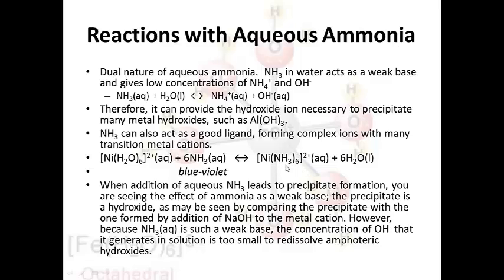So each of those water molecules is displaced by an ammonia molecule. And this is a blue-violet complex here. Okay, so this blue-violet is really this color.